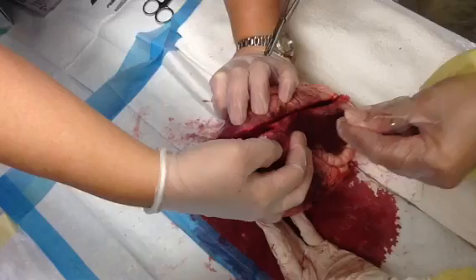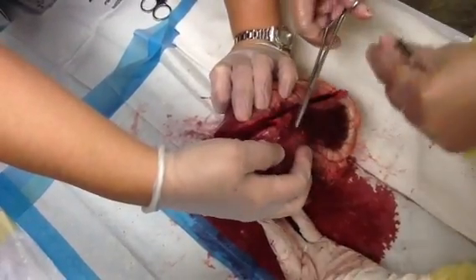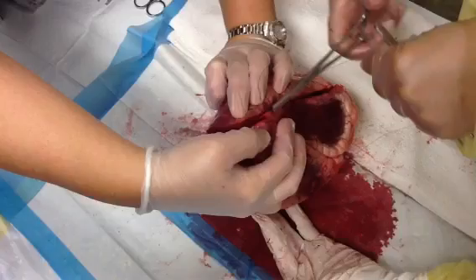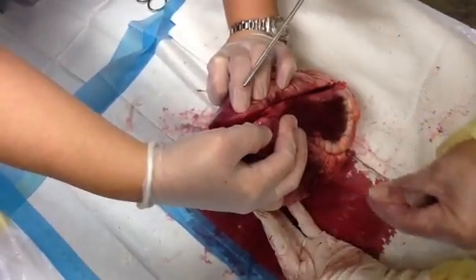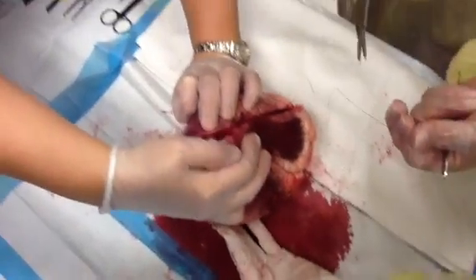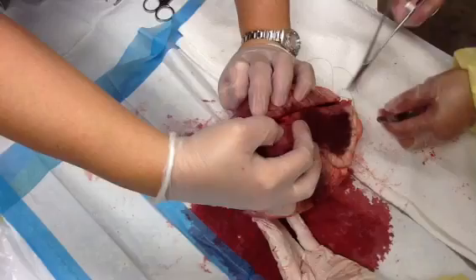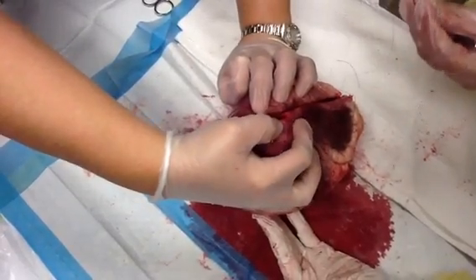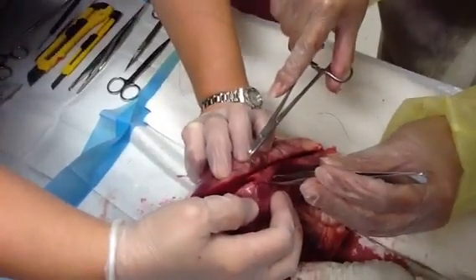You would use dissolvable if you were doing internal sutures, and non-absorbable — well, in the heart of course you're going to use dissolvable. If you were doing skin, you'd use non-absorbable. See, the bite breaks because it's not the proper size suture. Let's try this again — it's not the right size suture.